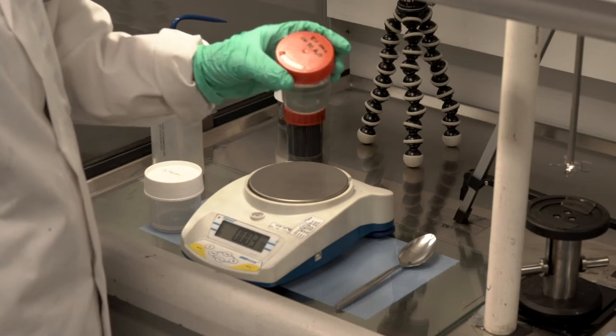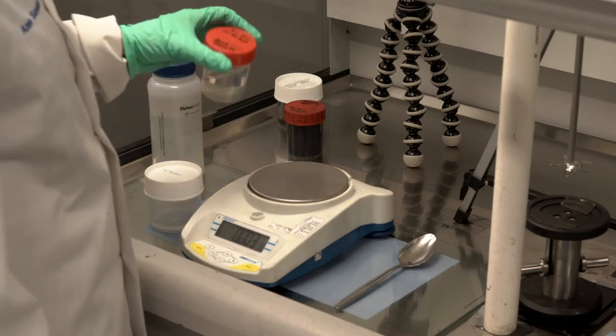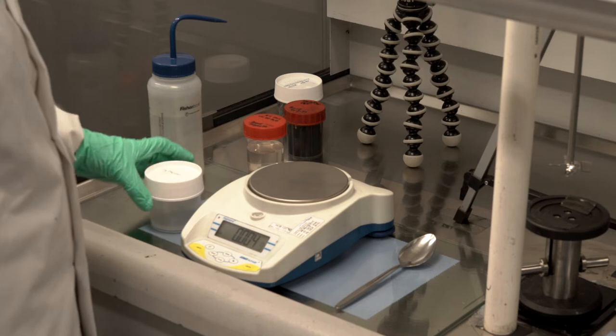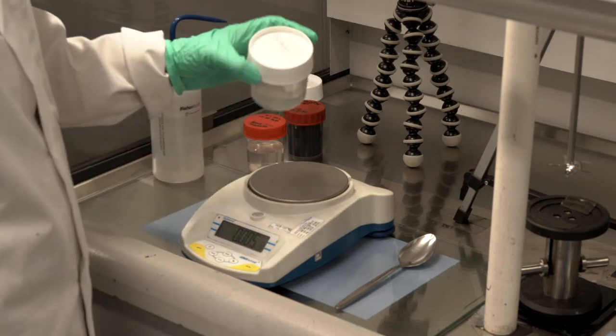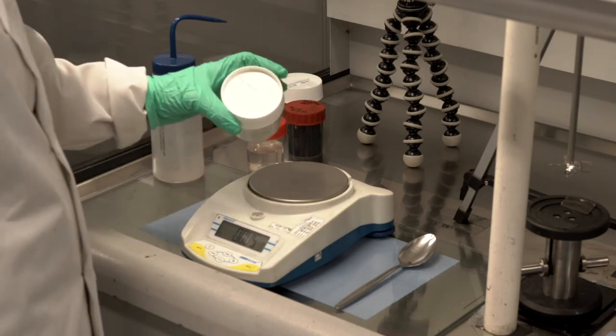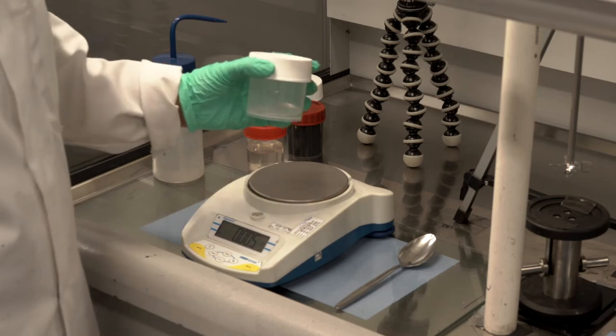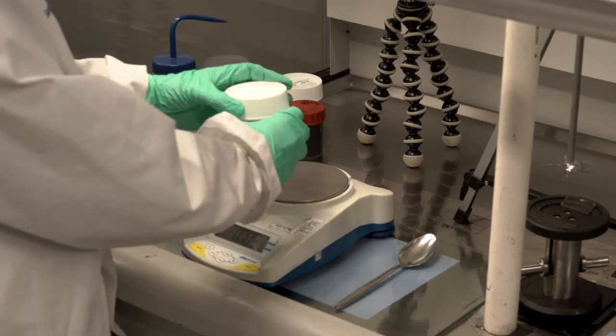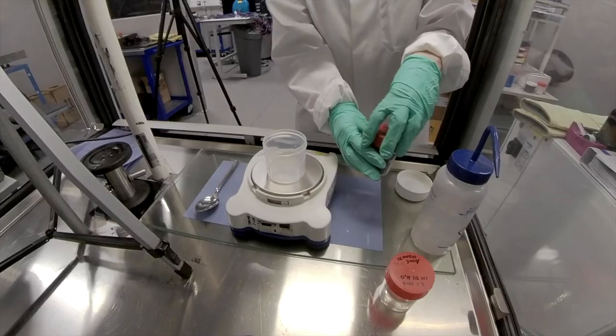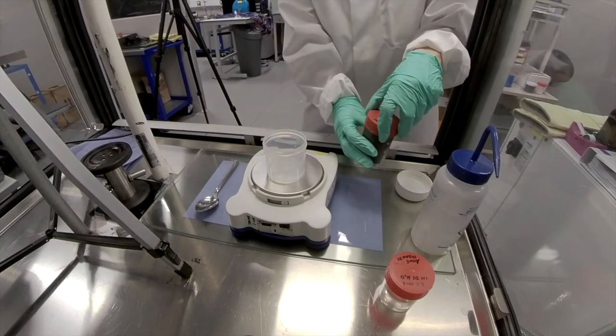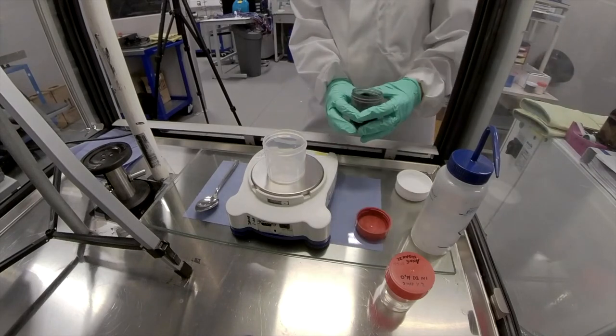I start one batch of my hard carbon slurry with 12 grams of that solution, to which the first ingredient I'll add is my conductive additive. I want to add 0.24 grams of carbon black.